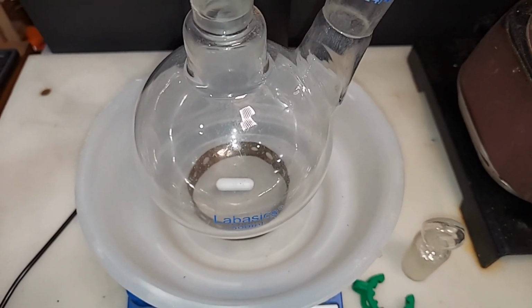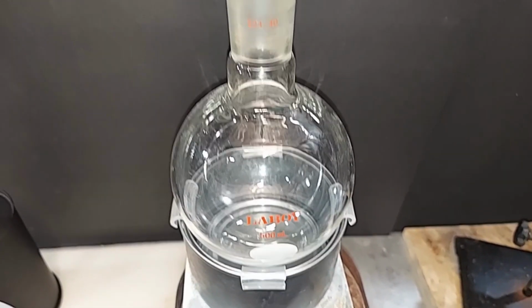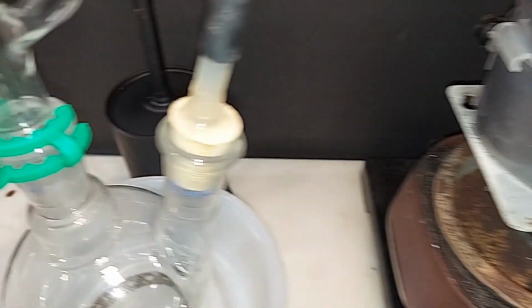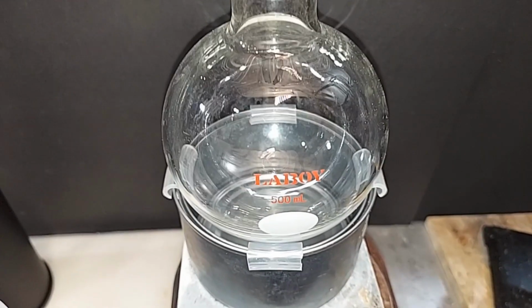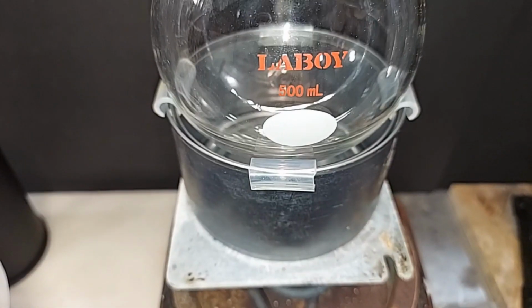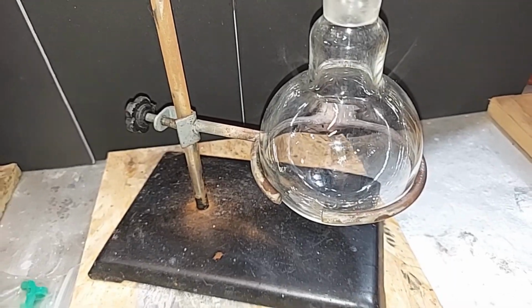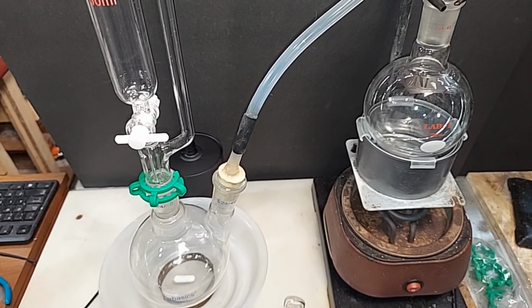Once that's done mixing, which will take several hours, I'm going to take this 500 milliliter off, which was just a placeholder for the distillation setup here, and I'll be putting this up here while that hole right there is plugged with that and clamped on, just to make sure it's held on strong. And then over here, this is a simple distillation. Once that entire mix of methanol, potassium dichromate, and sulfuric acid is over here, we'll distill it with a hot oil bath. That's why that's there, very carefully, until we have our formaldehyde gas with some water come over and drip down in here. So that's it. It's not really that complicated. It's just going to be a slow reaction time. It's going to take a while to do.